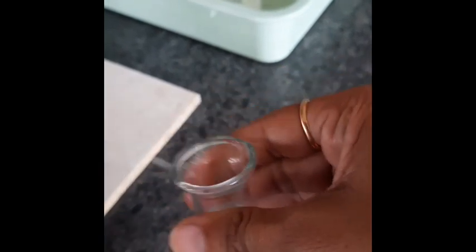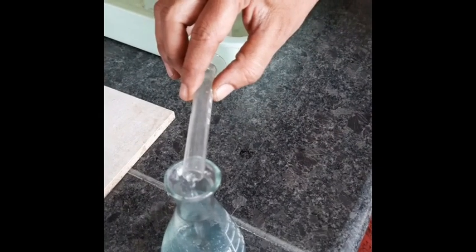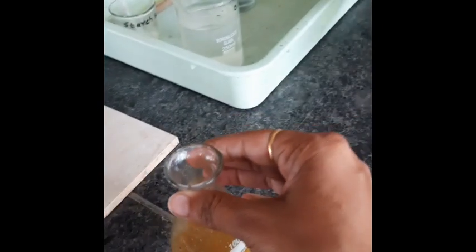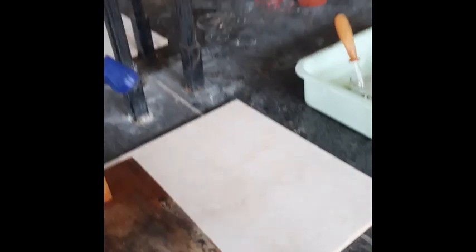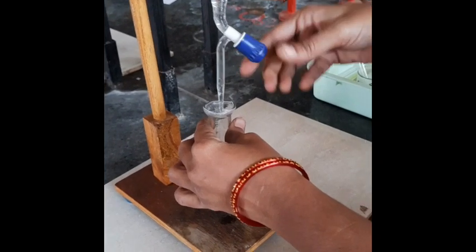Now I am going to add the KI. When I add the KI, the solution will appear yellowish brown in color as iodine is liberated. You can see here the yellowish brown color. Is it visible to you? Now I am going to titrate the iodine which is liberated with this sodium thiosulfate till that yellowish brown color changes to pale yellow.